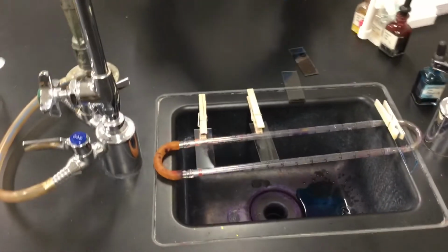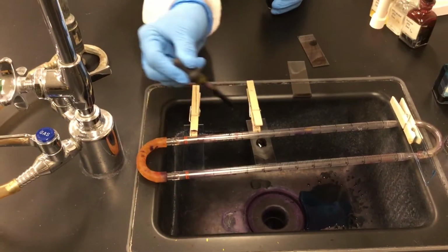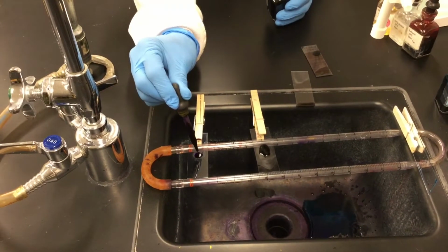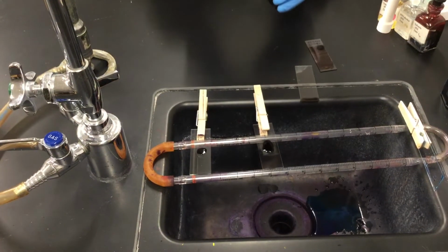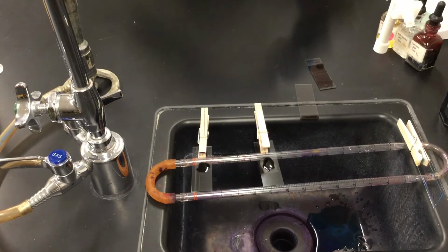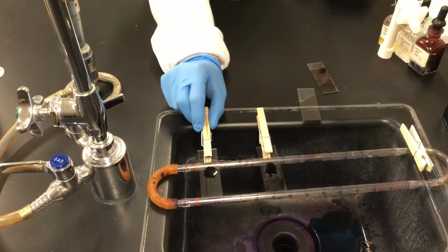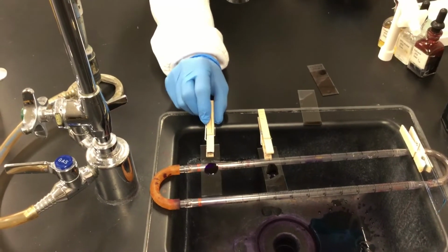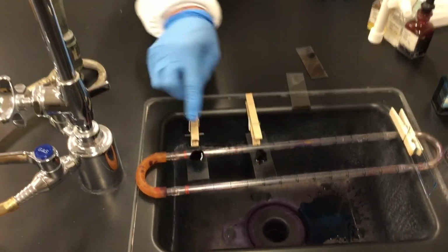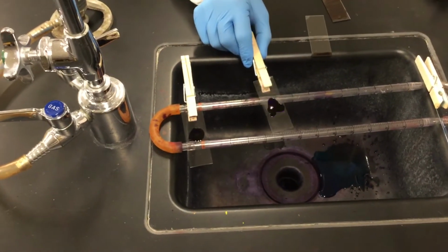So I'm going to add crystal violet, like 2 drops to each slide. And if you see in your slide that you are still not covering part of your smear, what you can do is just move it a little bit. Like in this case, I have more smear than that. So I'm going to move it a little bit to cover the entire smear.